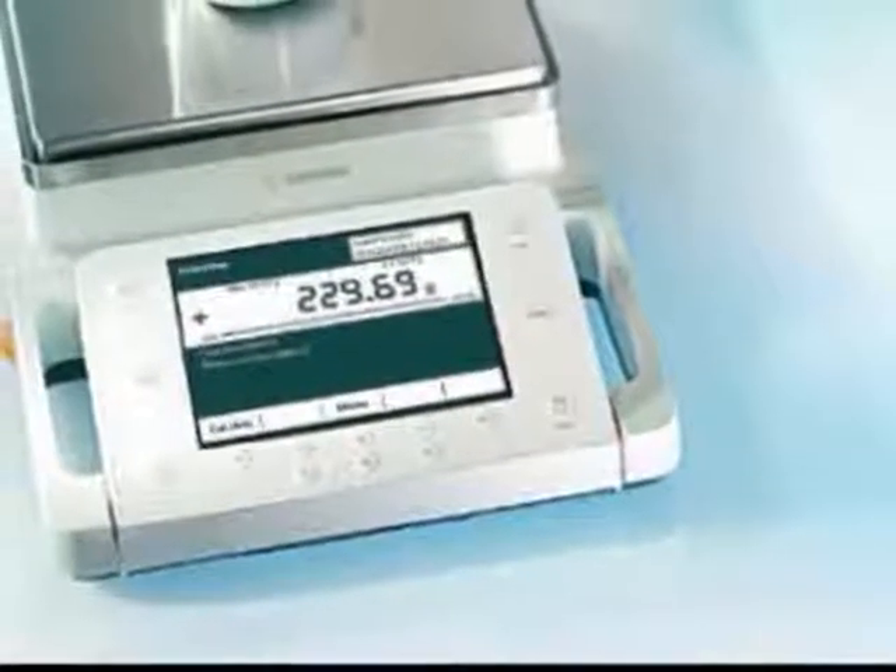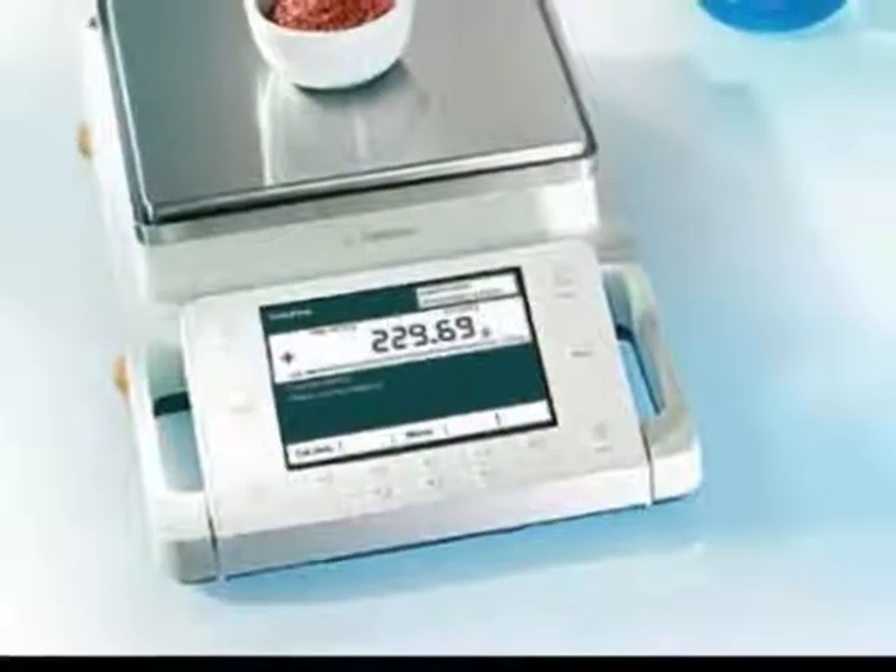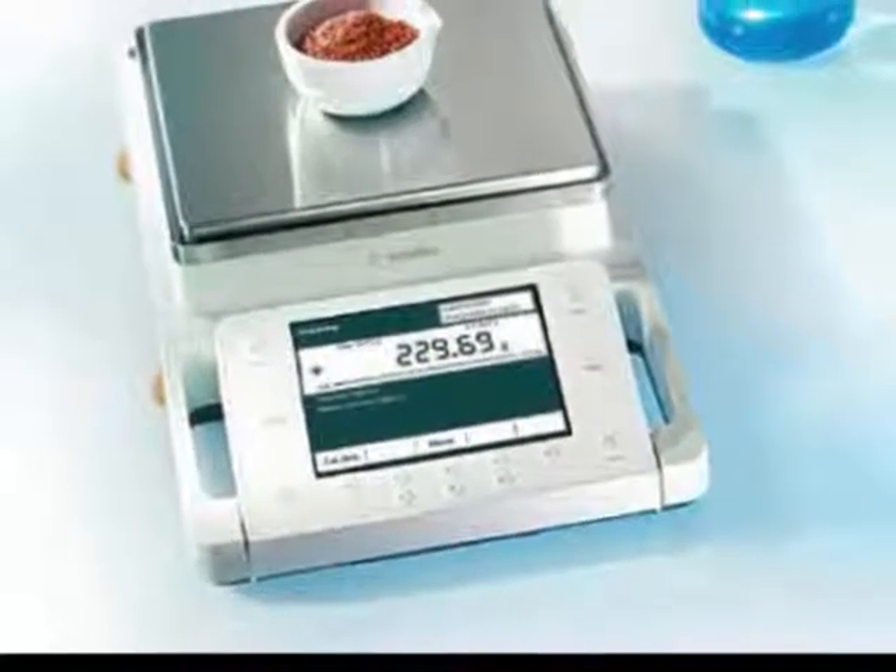QBIS offers the ideal draft shield chamber for all analytical balance models and can be quickly and conveniently cleaned for spotless results.